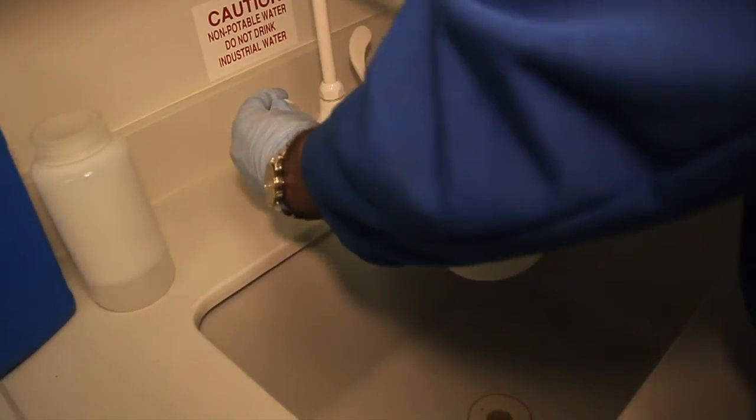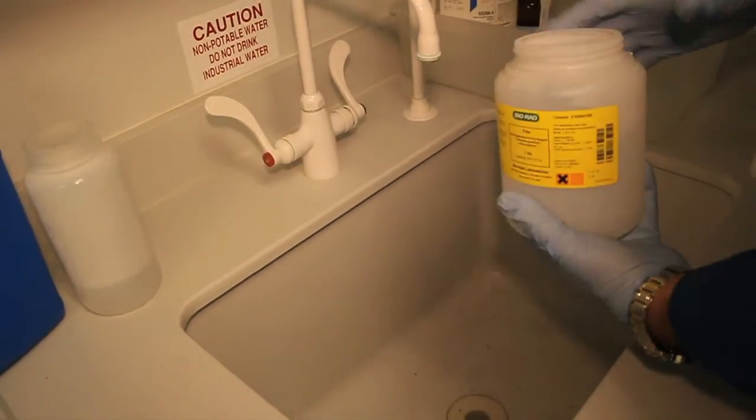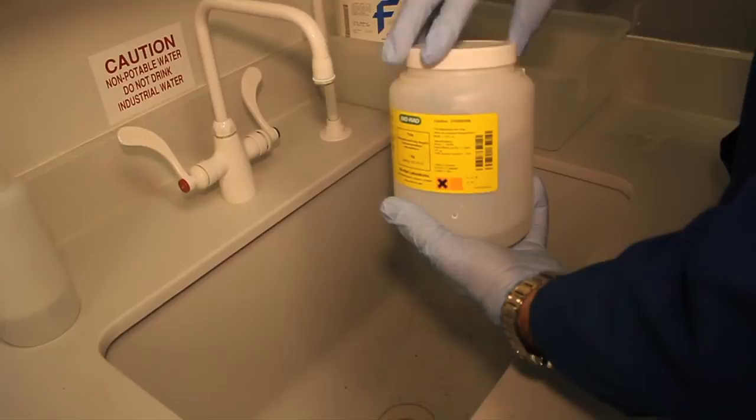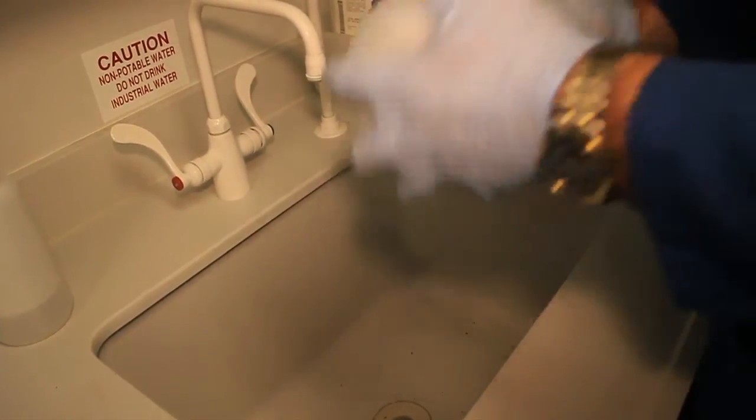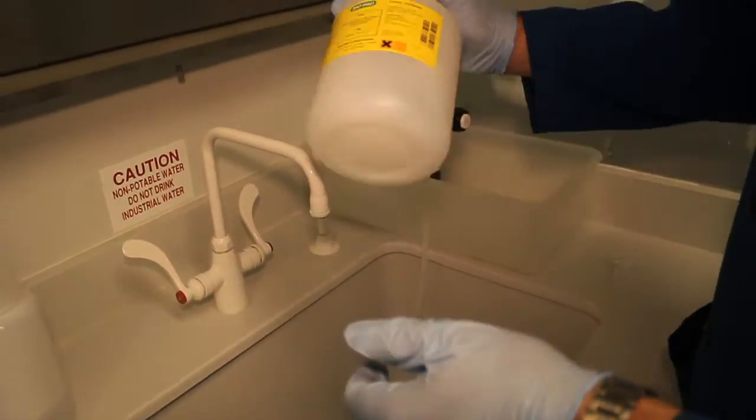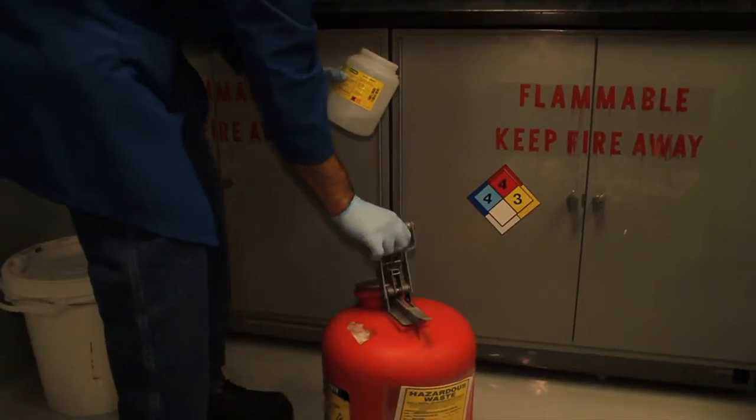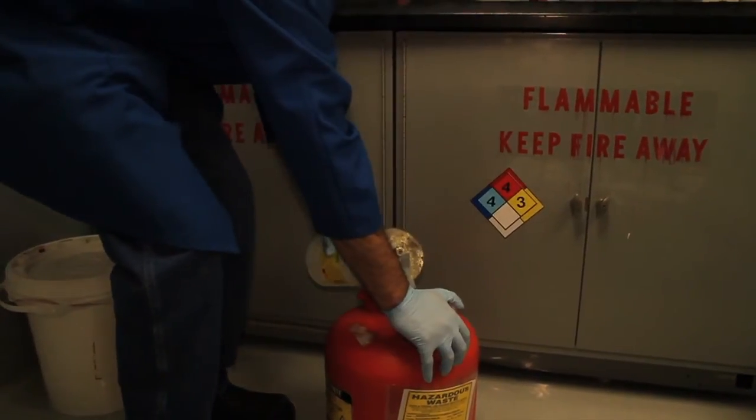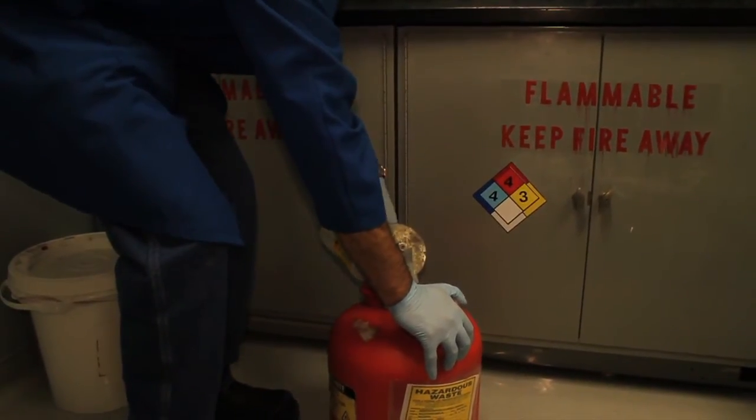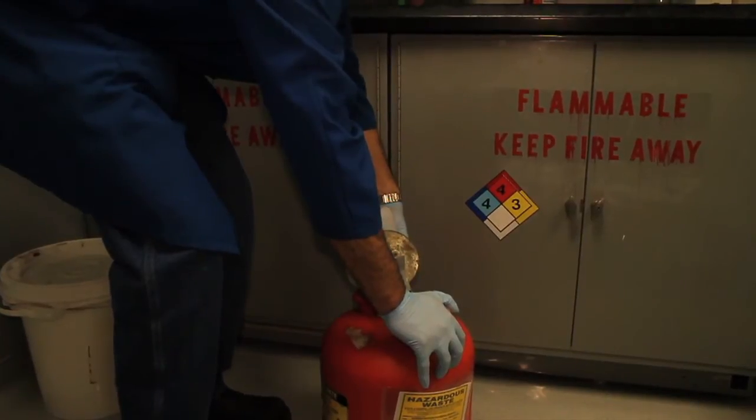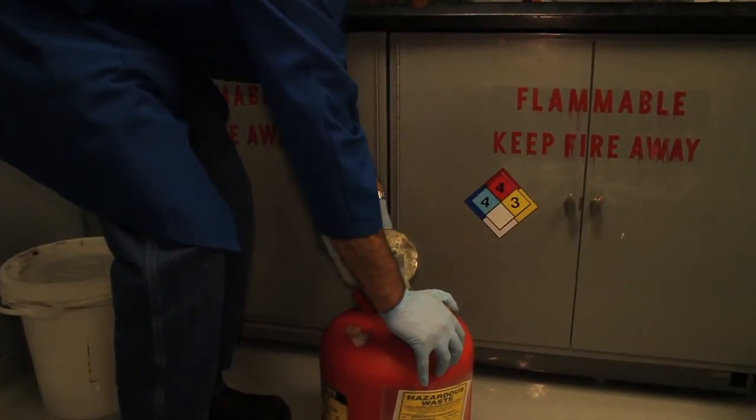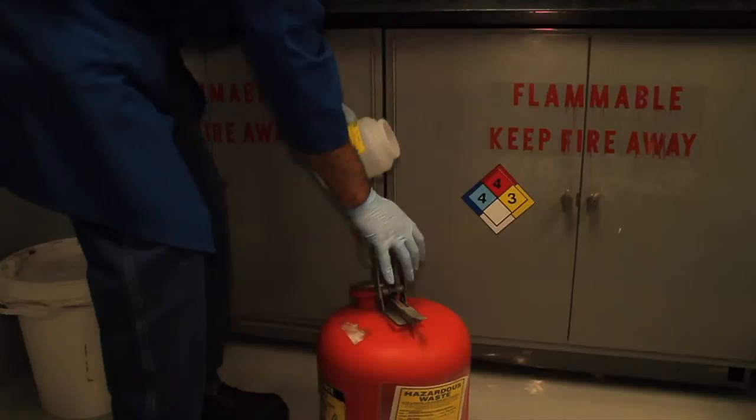If not, fill the empty container with a little bit of water. Now pour this mix into the flammable organic solvent waste container. Repeat this process three times.